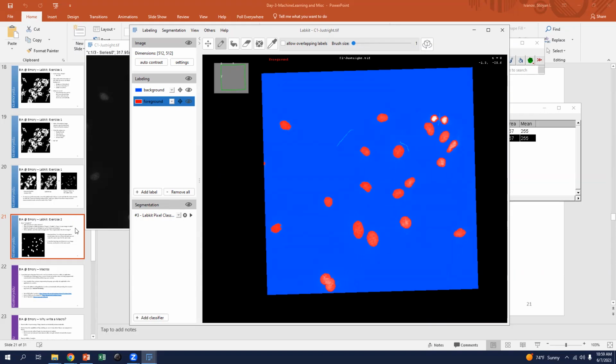Like, can we add levels for the training? Yeah, so you can add additional labels if you have different kinds of structures in the same image. I don't know the functional limit, but I expect 10. You could probably go longer, but the more extreme the use, the more likely it is to fail. I can't really speak to how effective that is right now. But yeah, you can add more labels.